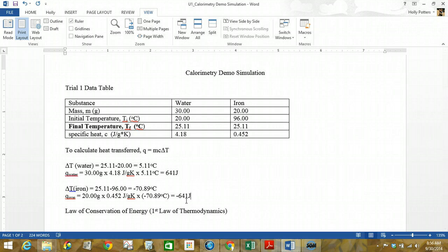We know that we can measure the temperature change of, usually, water or a solution, and then from that we can figure out the energy that was gained or lost from our system. So again, in calorimetry experiments, typically the system is going to be our chemicals that we put into water, or the chemicals that are in solution in water, but we're measuring the temperature change and using the mass and specific heat for water to help us figure out that energy that came from or went to our system.